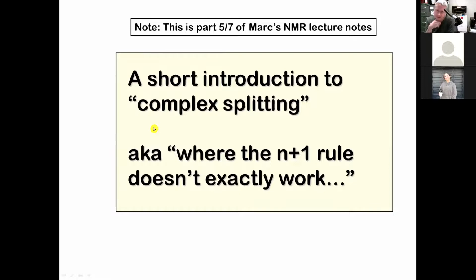What were the 3 things we get from NMR, proton NMR? The first thing we learned begins with the letter I. Integral? Integral or integration, yeah. That was the area under the curve, and that was the number of protons represented by the signal.